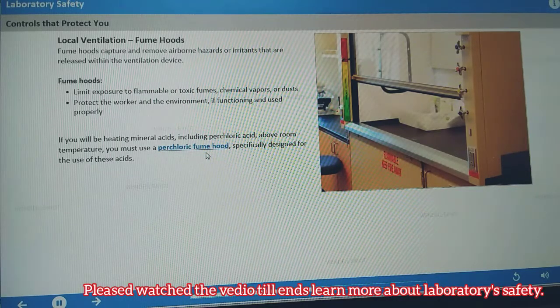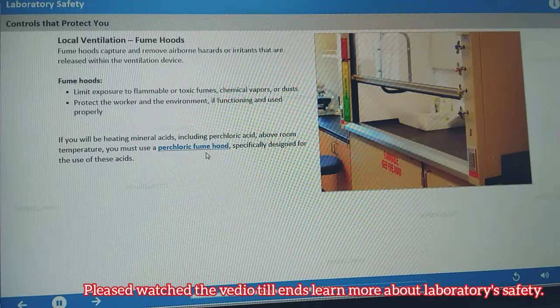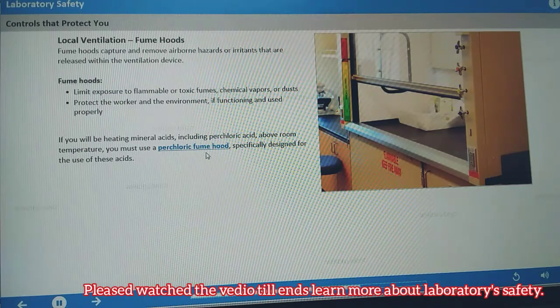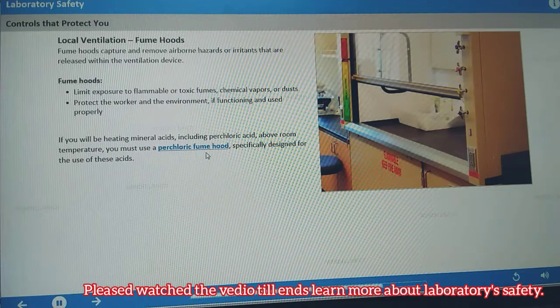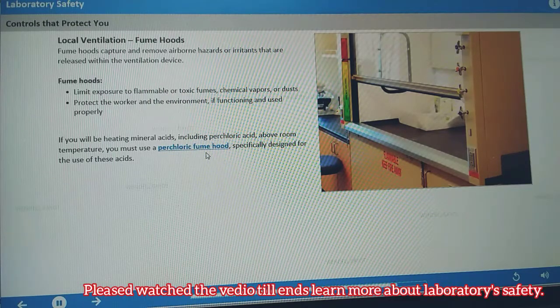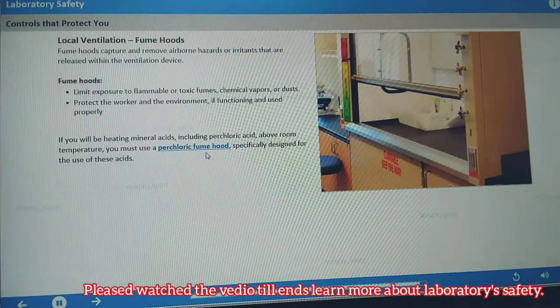A fume hood protects you by constantly pulling room air into the hood and exhausting it outside the building. If you are using any chemical in a way that could produce airborne gas, vapor, mists, dust, or fumes, the operation should be conducted in a fume hood or glove box. This will reduce or eliminate the risk of exposure by inhalation.